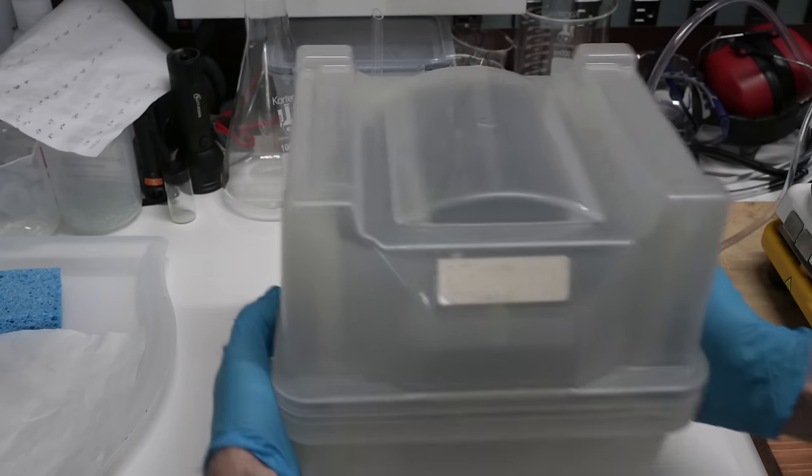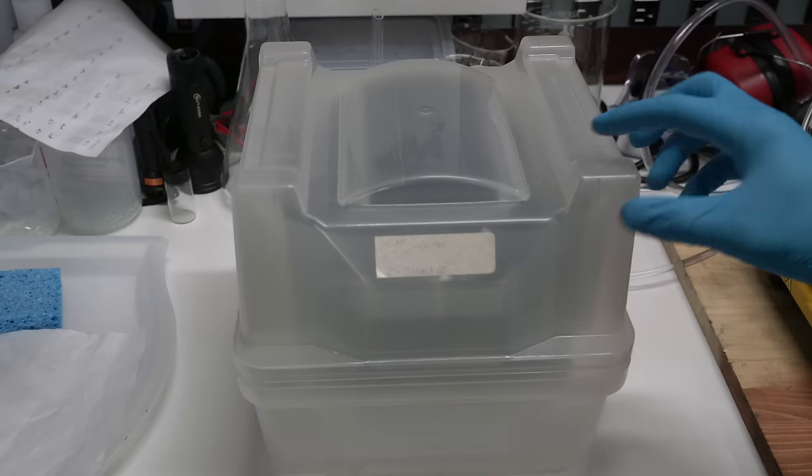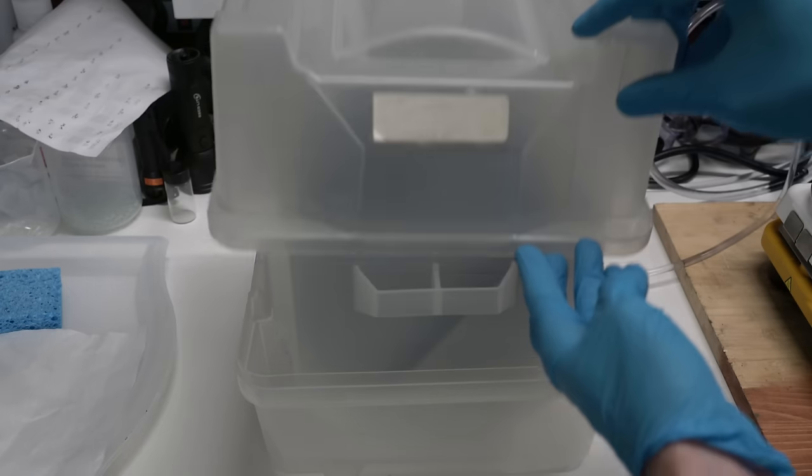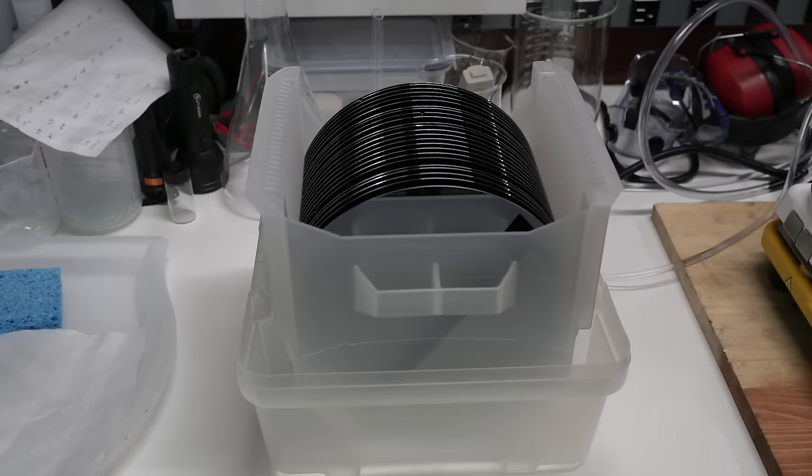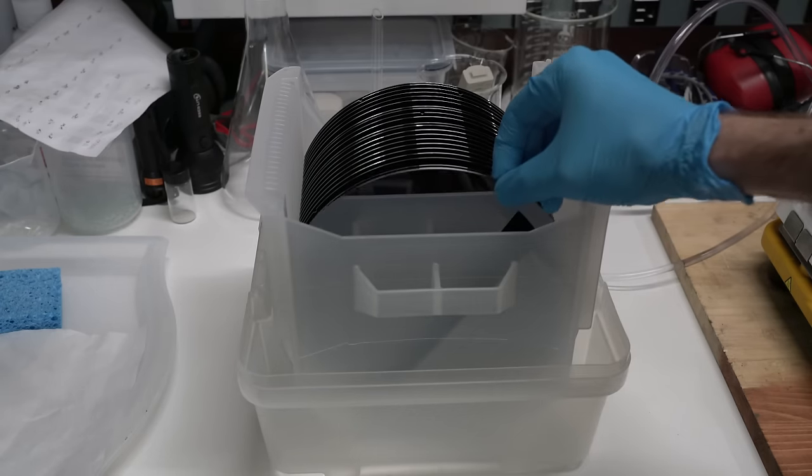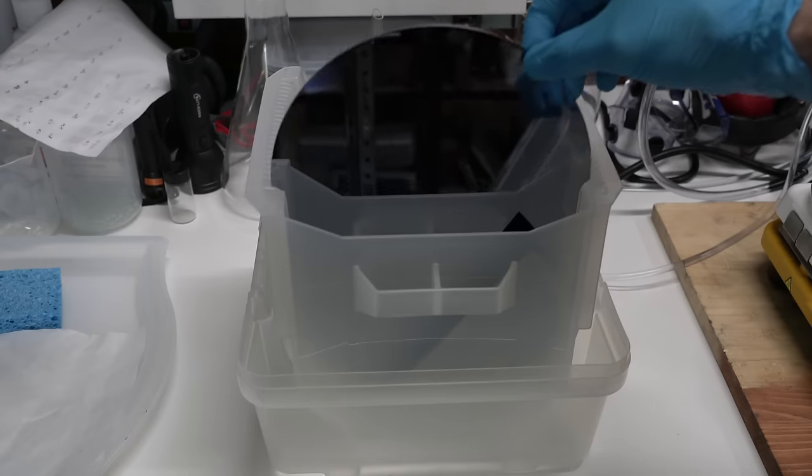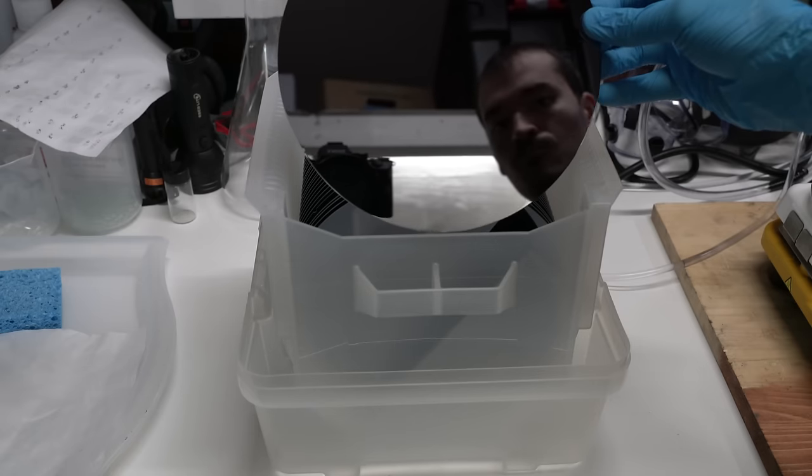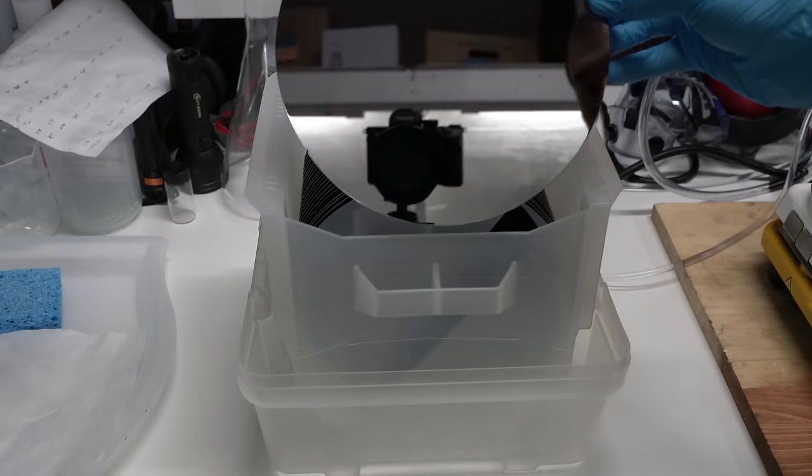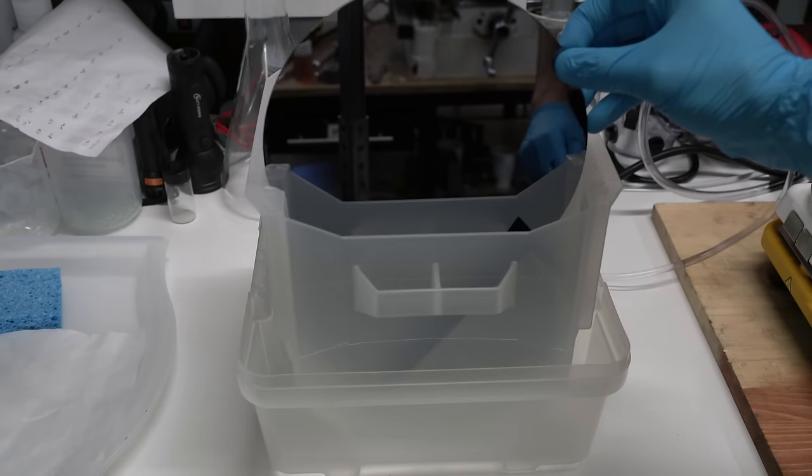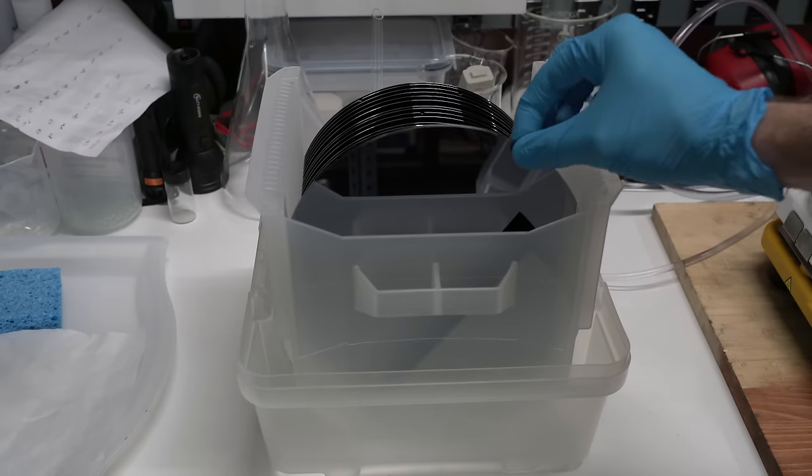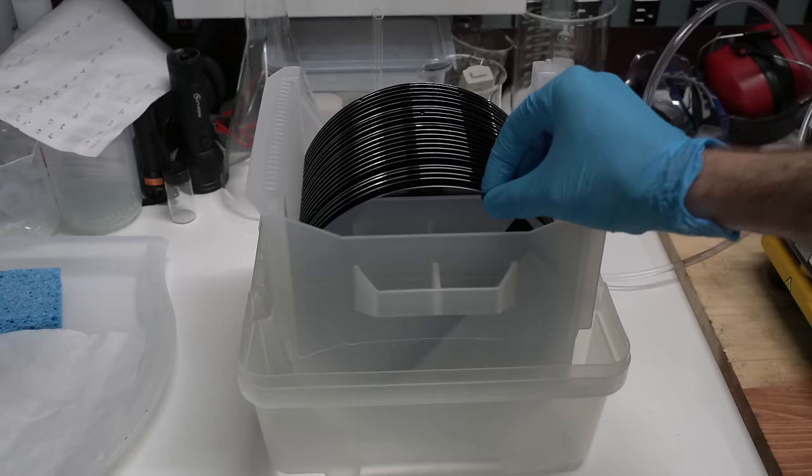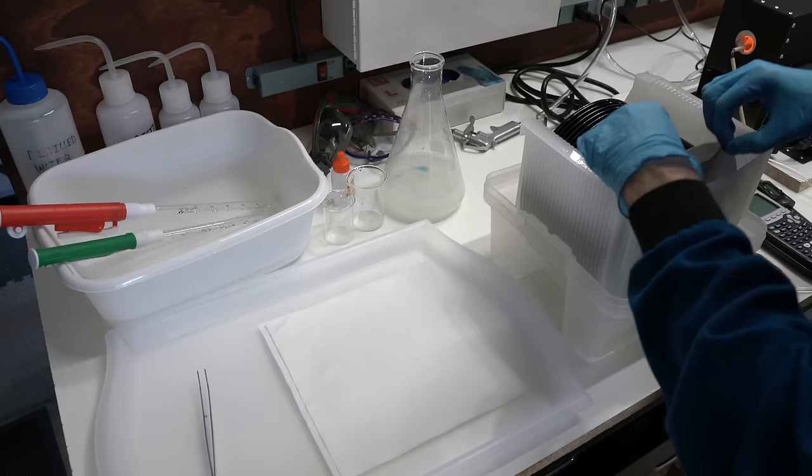Now we need some silicon. I got these wafers from an auction on eBay for dirt cheap, but you can also buy wafers new from lab suppliers and even Amazon if you want. These wafers are actually not pure silicon. They are already doped with an extremely small amount of boron, but that won't affect the oxidation process at all.